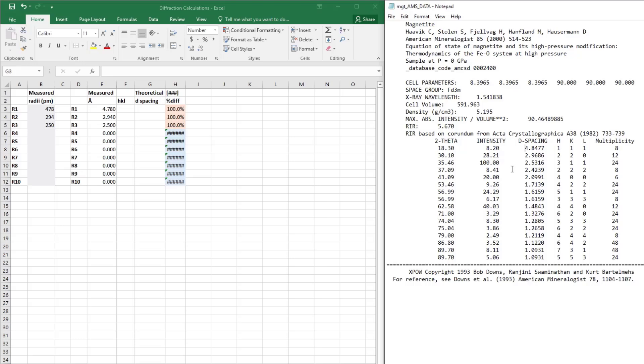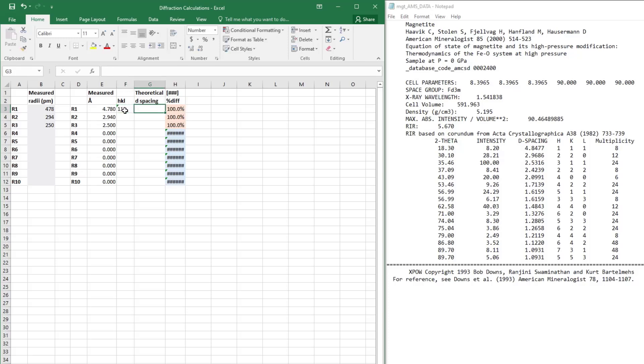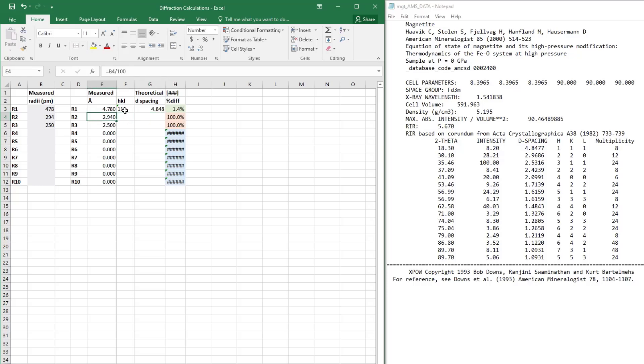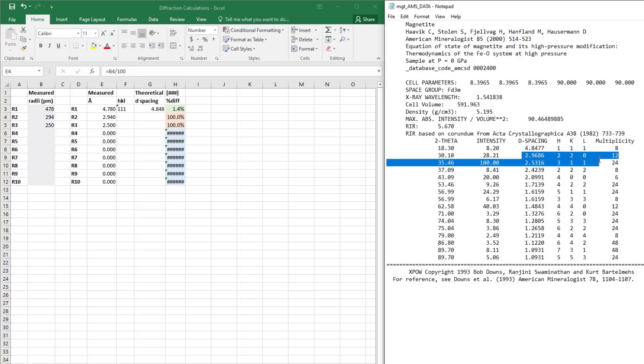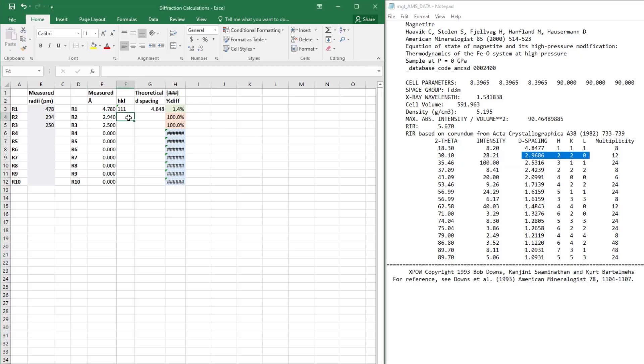I'm going to choose the best matches that I see. For this first ring R1, the best match is to the 111 plane in magnetite, which is 4.847. For the second ring, the best match is the 220 plane, so I'll type in the D-spacing for that into the spreadsheet, and you can see that the percent difference is auto-calculating because I have it set up to do that.